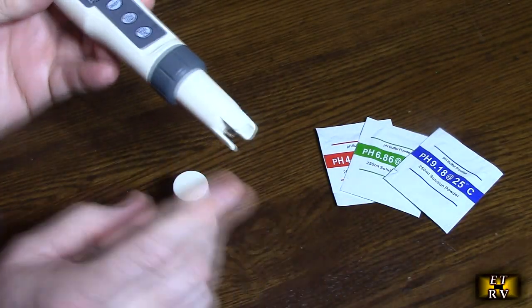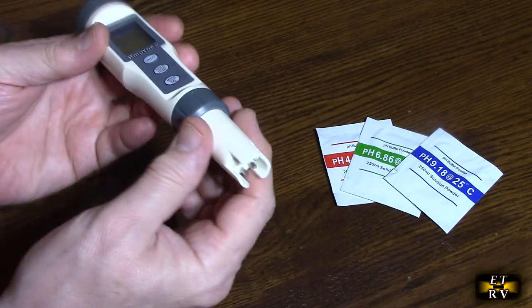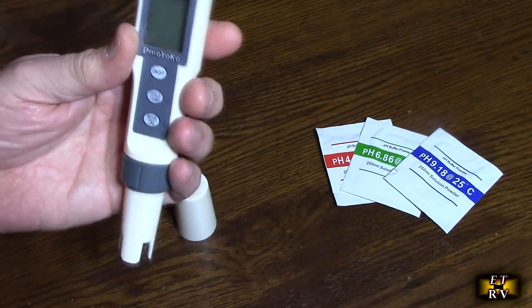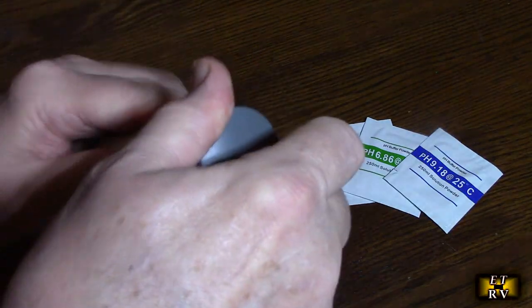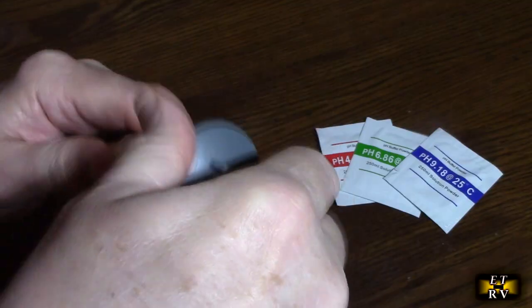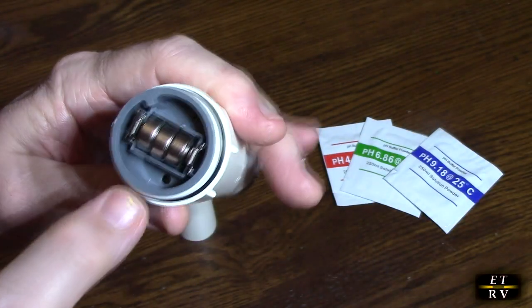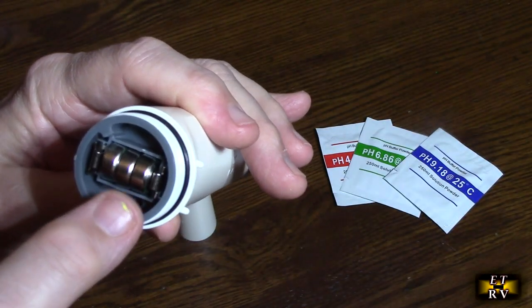This is a little cover. After you use this, make sure you let this air dry so that it will be ready for the next use. It does include the batteries you're going to need, and they're right on the top right here with a gasket. I think they're LR44s.